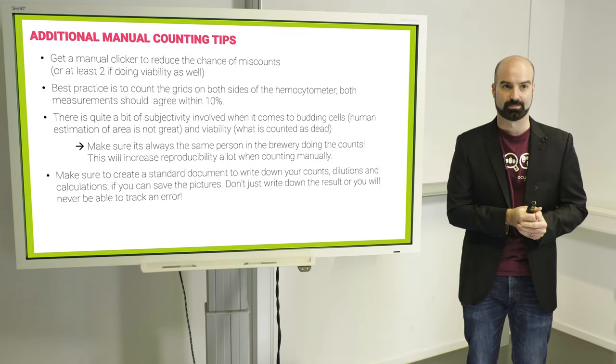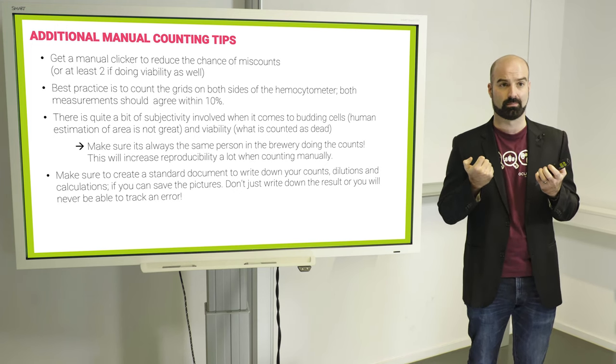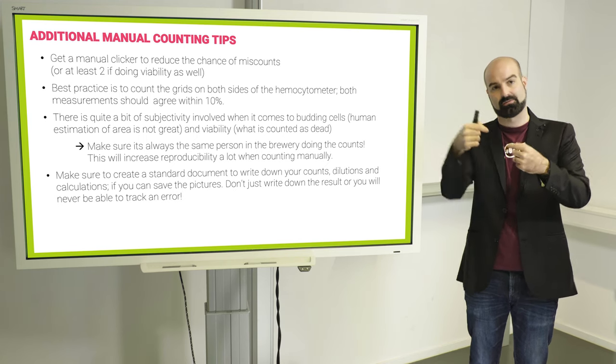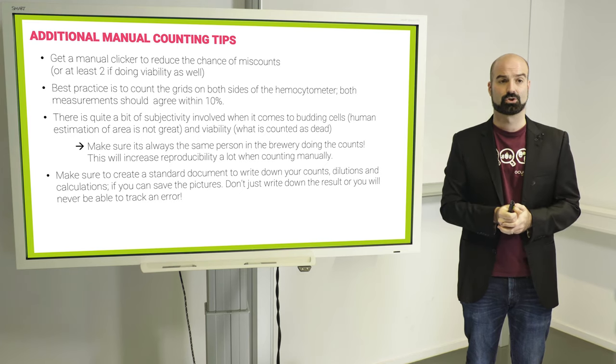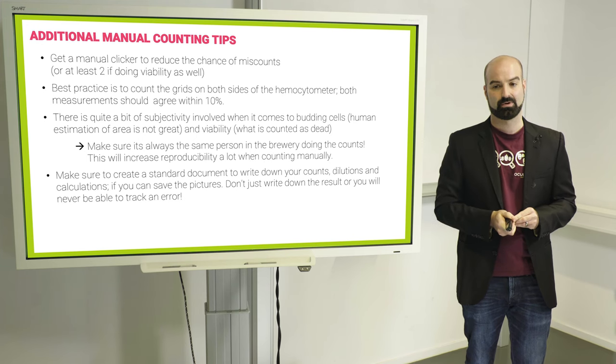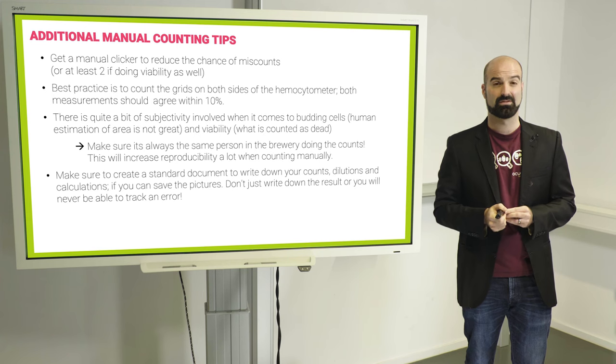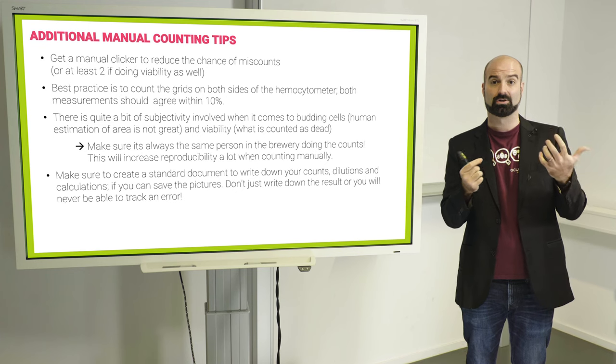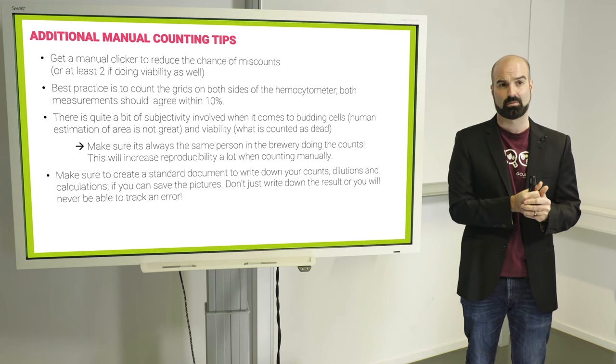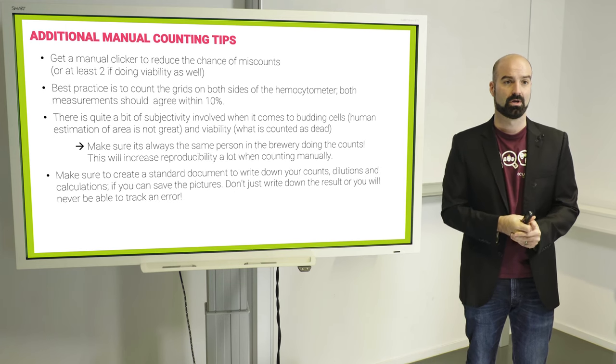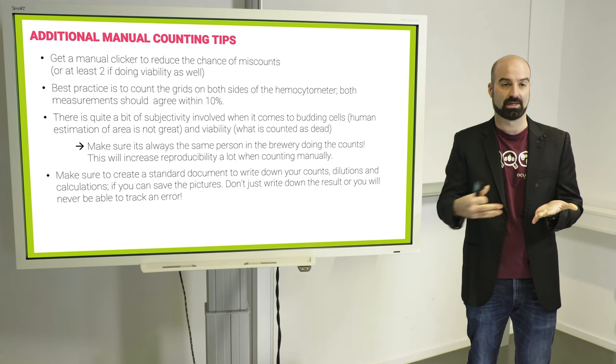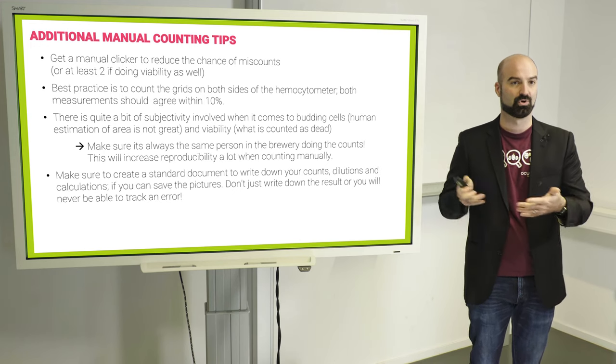And some additional final general tips. Get a clicker if you're counting manually, even better get at least two clickers if you're doing viability as well to not get mixed up. If you're using a hemocytometer, count both sides. So there's two sides of the chamber. Do one side first and fill the other and count that one as well. And the results should be fairly similar to make sure you didn't make a mistake. And very important, have the same person do the count every time. I know this is not easy in practice every time, but there's quite a bit of subjectivity, especially when it comes to budding cells and viability. Is it blue? Is it not blue? Is it 50% of the area or is it larger? Humans are not great at estimating the area of circles. So if one person does it all the time, he might make mistakes, but he'll probably tend to make mistakes in the same spots. So at least it's consistent. And finally create a standard document where you just fill in the data that will alleviate the pressure of filling in the steps you did for the dilution. If everything is pre-written and you only put down the numbers, print a stack of them and keep in the lab.